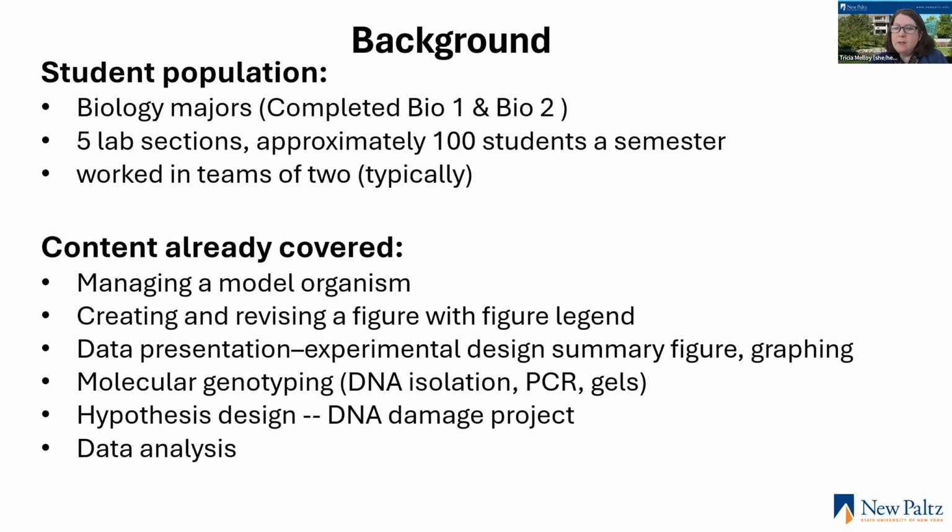Some of the content that is already covered at this point in the semester when we do the independent project includes things like managing a model organism. We heard in the previous talks about creating a figure, revising it, creating a figure again. We do that as well. They've learned about data presentation, experimental design, and they've done various techniques, including things like molecular genotyping, and they have carried out a smaller project on the effect of DNA damage on yeast at this point.